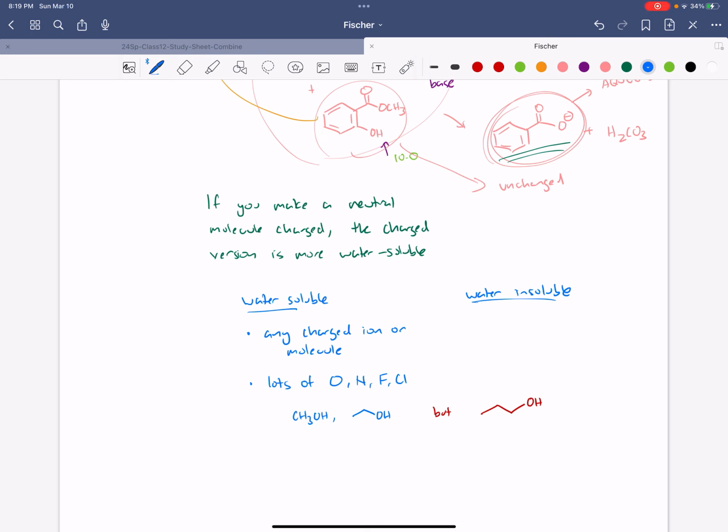For instance, so those are alcohols. What if we have carbonyl groups? So that is water soluble. That's water soluble. But once we get up to 4 carbons, but if we get up to 4 carbons like this, that's not water soluble. And actually, I fibbed a little bit. 1, 2, 3, 4, 1, 2, 3. We'll put 4 carbons here. Propanol is water soluble, so I'll put 3 carbons there.